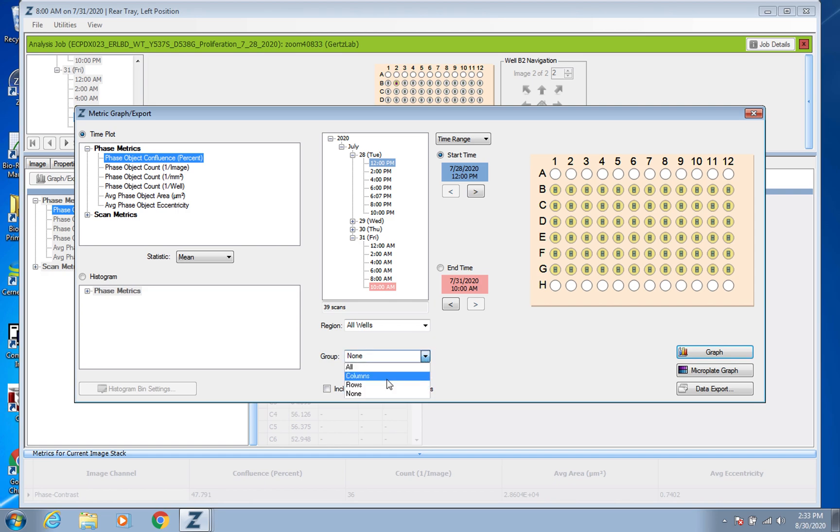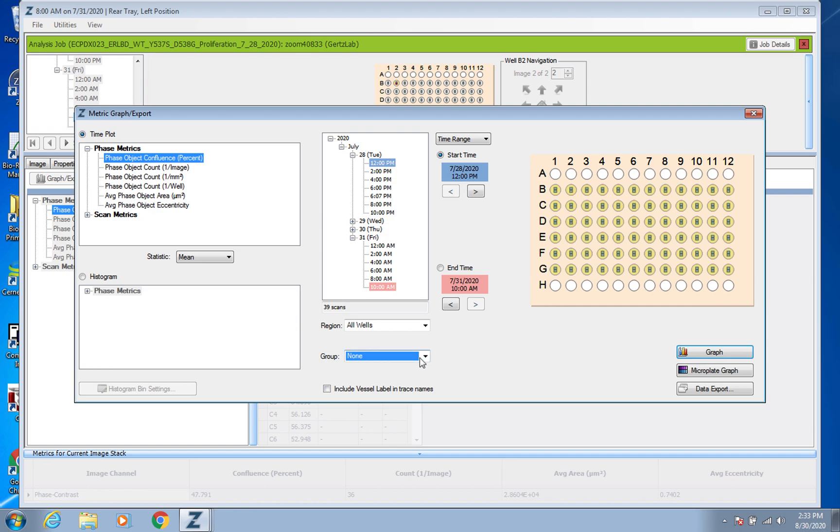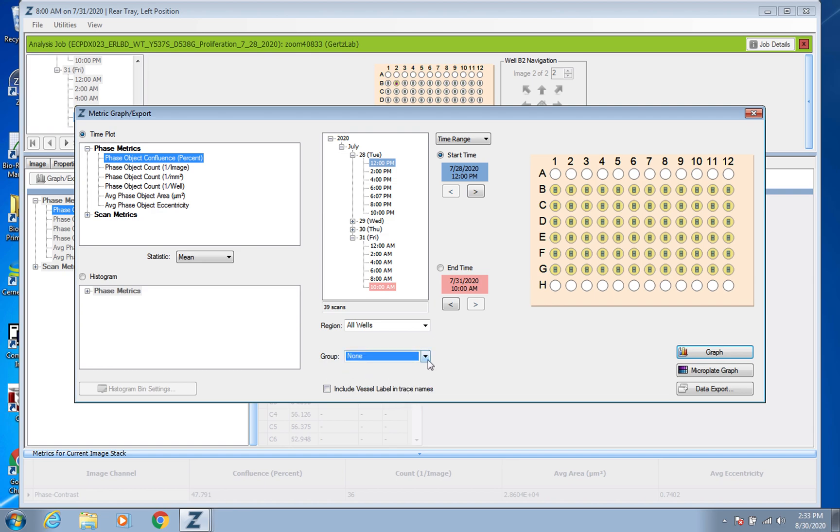And so then the key thing is to go down here to Group and click None, that way it's not giving you the average. Technically you could click Columns or Rows and it could give you averages, and when I've done it on All it kind of comes out weird too. So it's best to just click on None that way you're going to get each individual replicate piece of data and then you can graph them the way you want to and have the statistical power that you want.